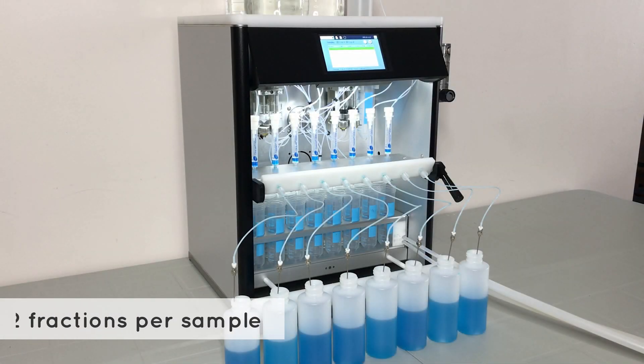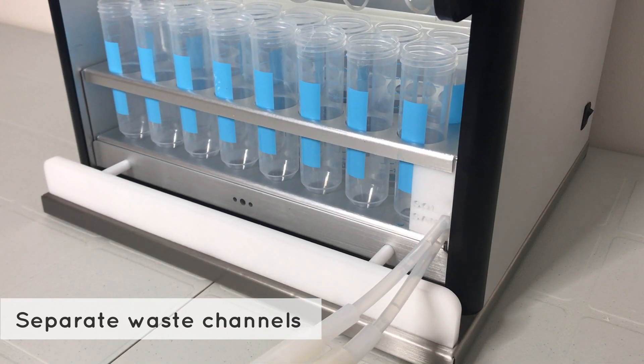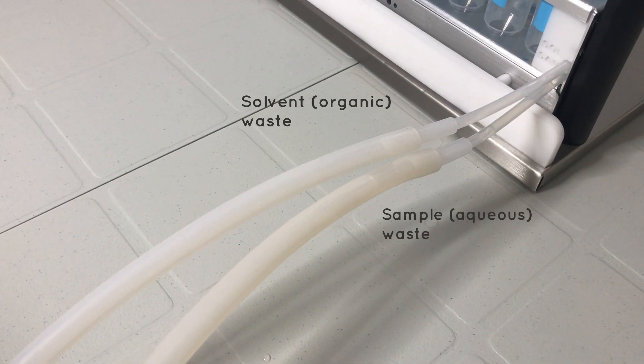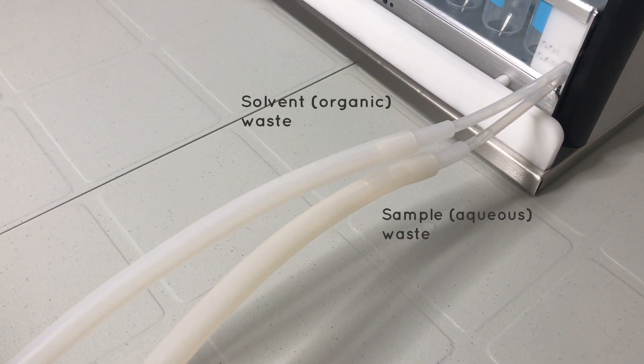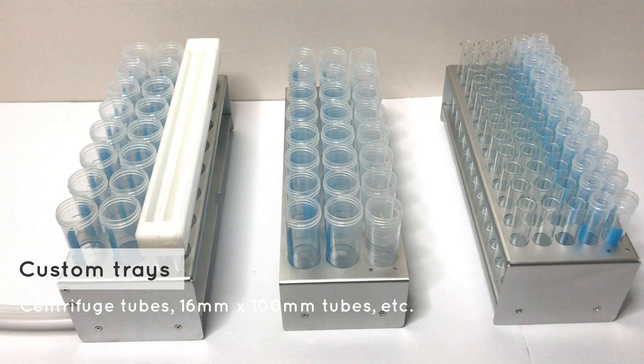Up to two fractions can be collected on the standard fraction collection tray, which also has dedicated outlets for sample and solvent waste. This is especially useful for labs that need to separate aqueous and organic waste. Let us know if your application requires a custom tray.